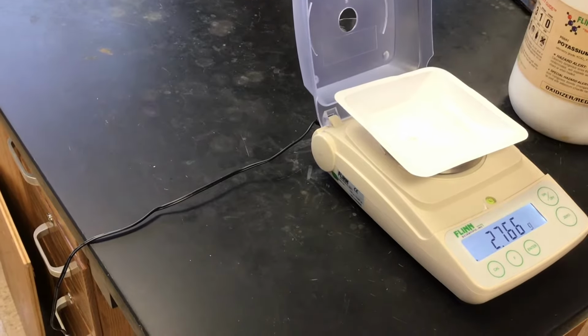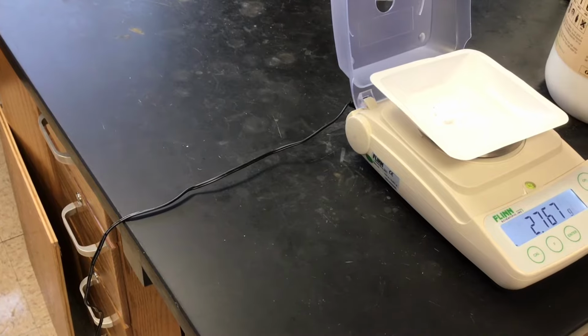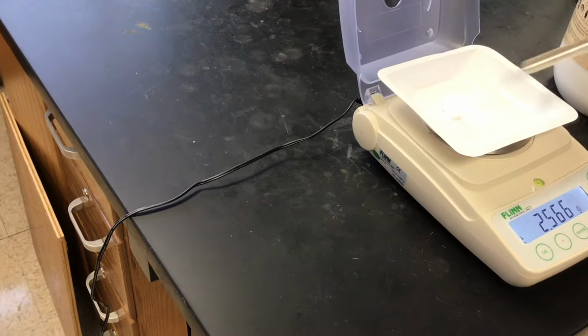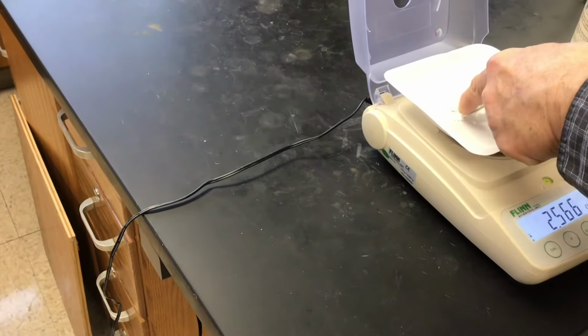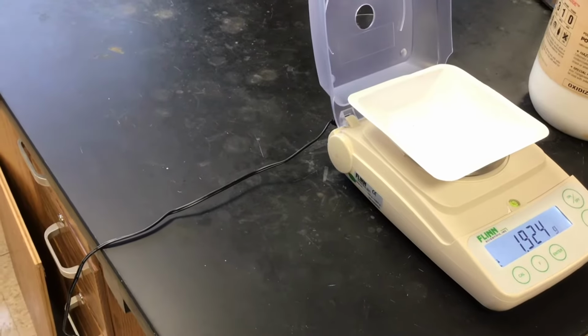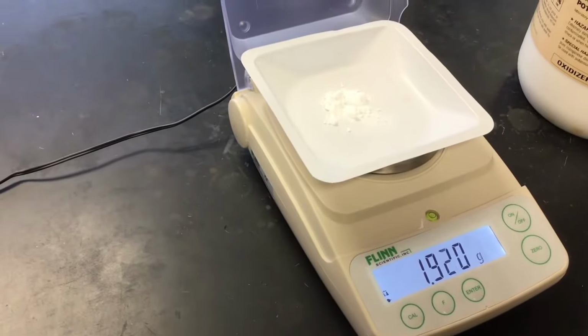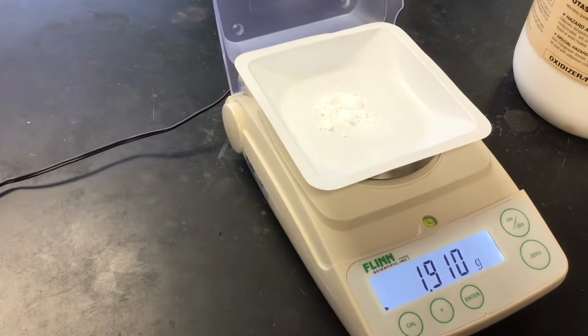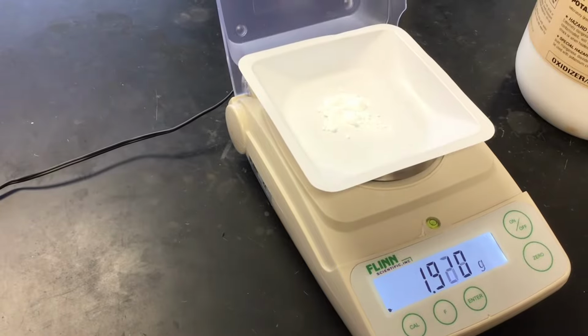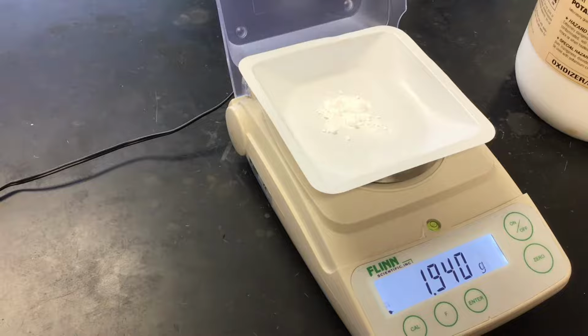Ooh, a little too much. We're trying to use somewhere between 1.5 and 2 grams, or something close to 2 grams. That ought to work. Okay, so there's our starting mass of potassium chlorate. We'll stop moving here for a moment while that finds its mass.